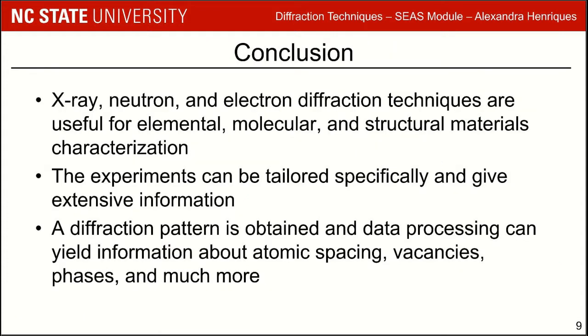In conclusion, X-ray, neutron, and electron diffraction techniques are useful for elemental, molecular, and structural materials characterization. The experiments can be tailored specifically and give extensive information. A diffraction pattern is obtained, and data processing can yield information about atomic spacing, vacancies, phases, and much more.